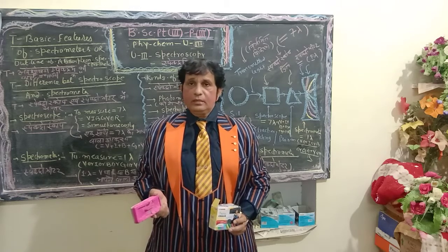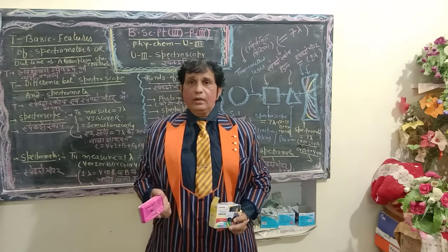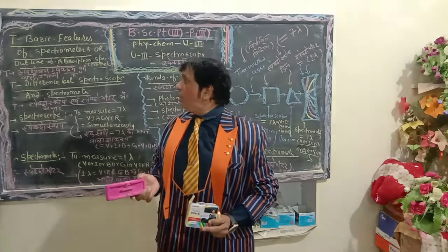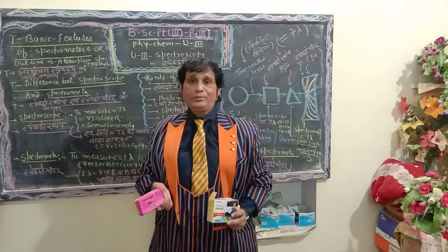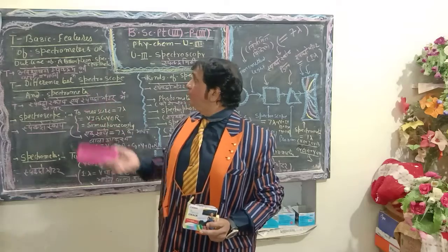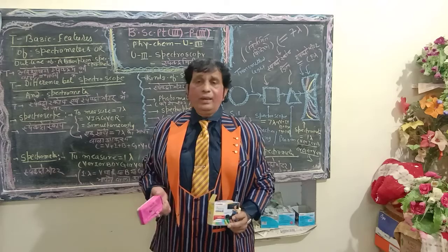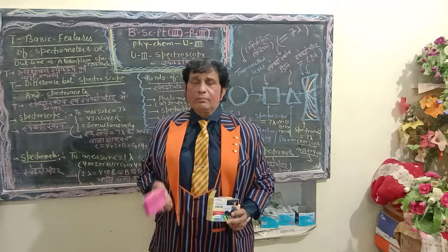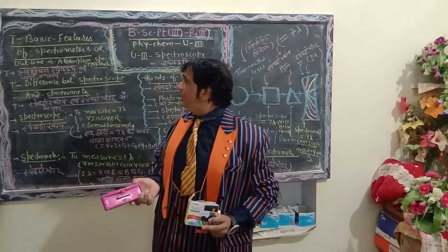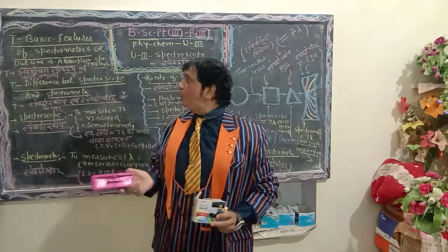Dear students of B.Sc Part 3, I am going to deliver today a very special lecture on the outline of absorption spectrometers, or the important features of spectrometers. Once again, I will deliver today my lecture on the outline of absorption spectrometer or important features of spectrometers.